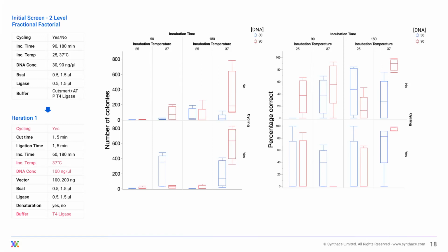And if we look at those same four dimensions, but for our second response, we can start to see that there is some really compelling evidence that we've got some conditions here that are giving us a very high efficiency. And so just looking at this data, we can start to identify things that we want to fix for our next DOE, things we're not going to change in our next DOE design, and some areas where we want to change the ranges for these particular experiments.